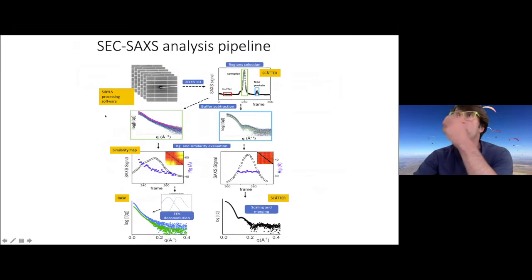So this is how the pipeline looks, what we do for you. We're collecting our images. Let's go immediately to integration, where we process scattering profiles for each image. And obviously, as Rob already showed in Scatter, I will go into a little more detail.